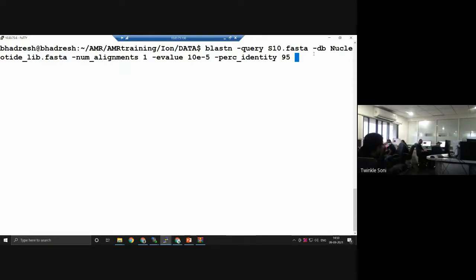In order to analyze it downstream, we first need to have this data in Excel format, as in tabular format. So outfmt 6 is there for it, and other formats are also there, which have a README file, and I will share the file with you. It will show you other types of out formats which you can use. But for AMR analysis, and basically for most analyses, we use out format 6, because it will give you data in tabular form. So just write -outfmt 6. Out fmt is out format 6.